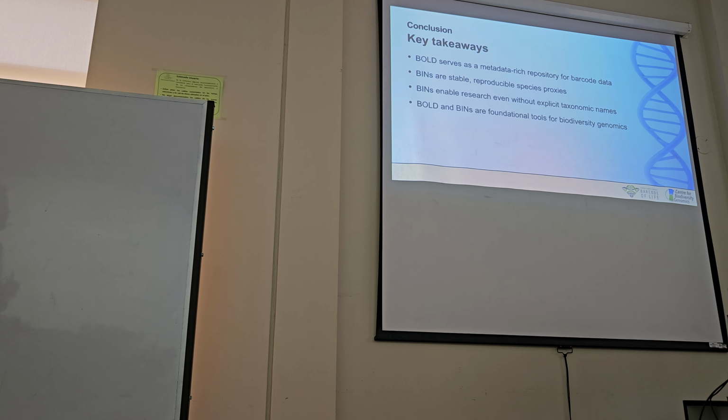Yeah, Robin, do you want to add? It's related to sequence identity, but it's not exactly the same as sequence identity, and I don't know what the precise calculation is. But suppose you have an exact match of your sequence to an exact species, and there are no other species that have that exact sequence. Then it would give you 100% confidence.